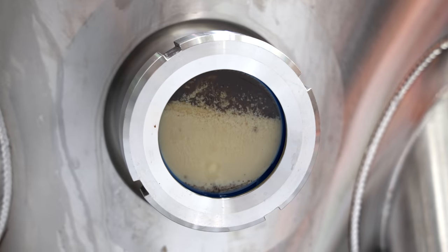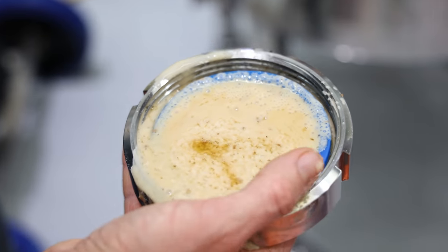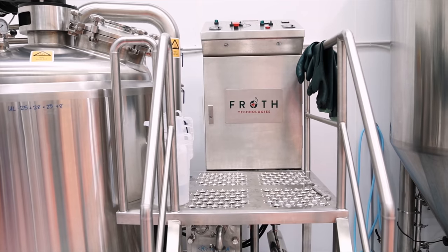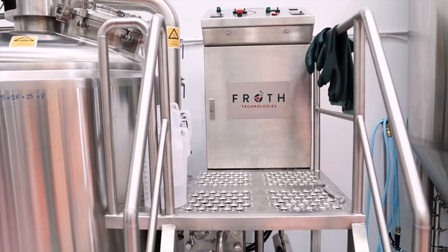Yeast! If you want to make any alcoholic beverage, you're not going to get far without the stuff. But I've realised that I honestly don't know much about how it is commercially propagated. Luckily, the owners of New Zealand's first commercial yeast lab are happy to walk us through the process.